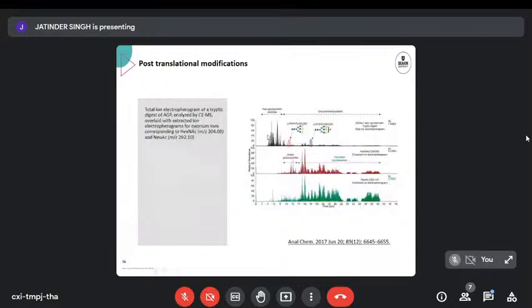And here we can see, based on the different mass profiles coming off the chip spraying into the mass spec, we can identify, based on the migration time, what class they are, and based on the mass, we can identify what the glycosylation order is if we use the extracted ion electropherograms. So we've got a tryptic digest here where we've got a total electropherogram, and then we can look at different masses, what the profiles are, and start understanding the glycosylation profiles. Just like normal CE-MS would do, but the separation is done faster on the microchip.